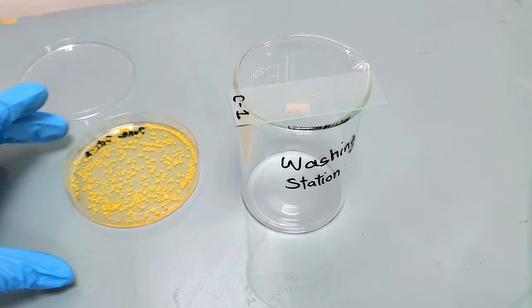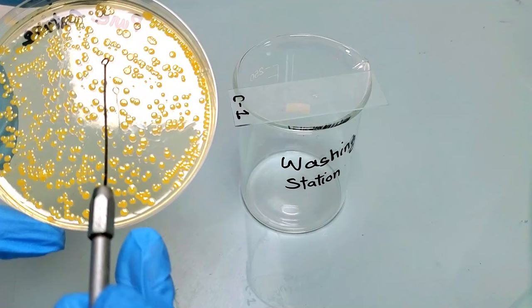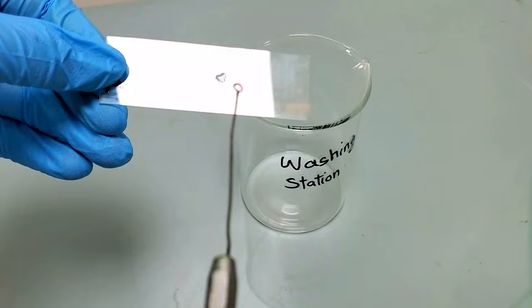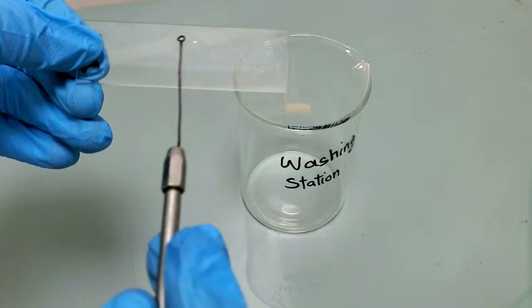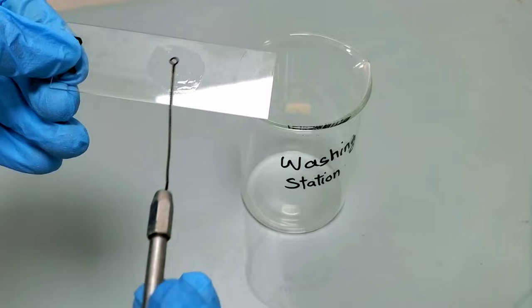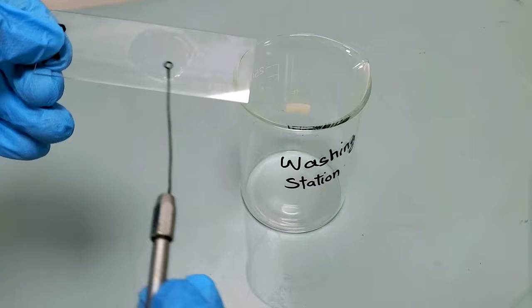Pick the bacteria which we want to identify just by touching the loop on a single bacterial colony. Ideally, the culture should be between 18 to 24 hours old, because the older cells may show variable results. Now, make the bacterial smear on the glass slide surface by mixing with the buffer solution. Distribute the cells evenly on the glass slide so that the cells are one layer thick. Spread the smear appropriately to get a good result of the Gram staining technique.